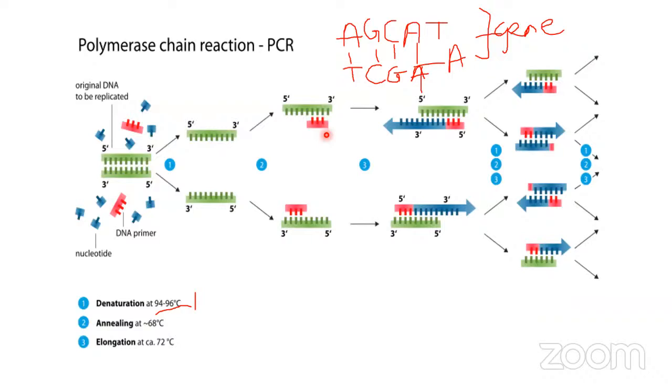So it is predetermined. If you want to look for, let's say, Mycobacterium tuberculosis, there's an existing primer for TB. You can either buy a kit that contains the primer already, or you can send the sequence to a commercial company that is responsible for making primers to make the primer for you and send it to you. Then you can dilute, aliquot, and use. So in summary, primers are predetermined. You can design a primer or use an existing primer that has been designed already. I don't know whether that is clear.